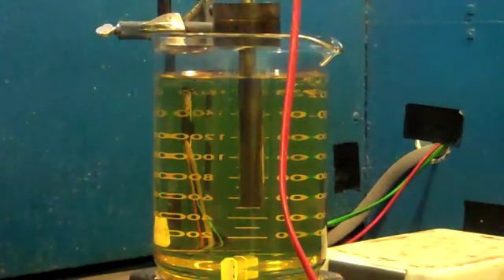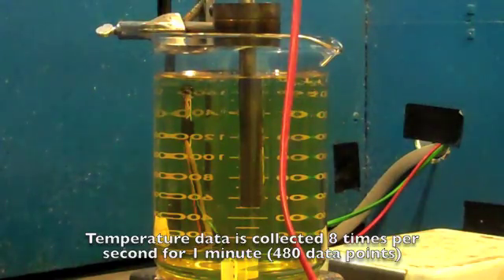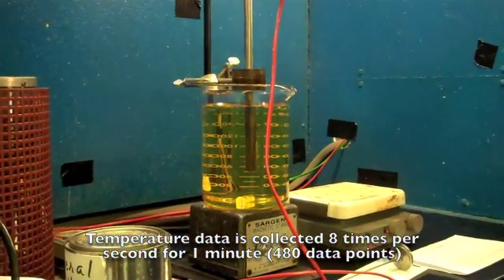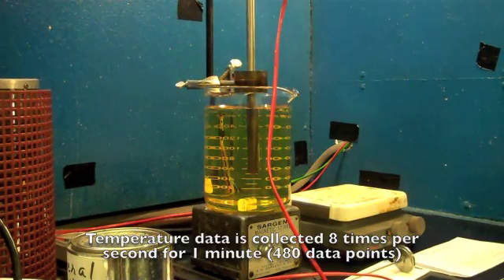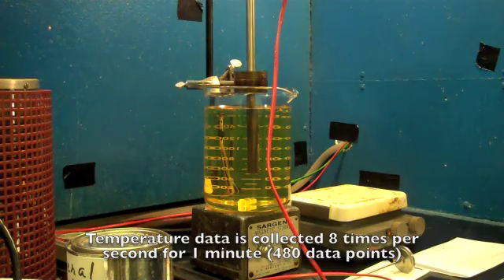As soon as the probe is placed into the quench oil, we start collecting data. The computer program collects temperature readings eight times a second for one minute. Our cooling curves are generated based on 480 data points.